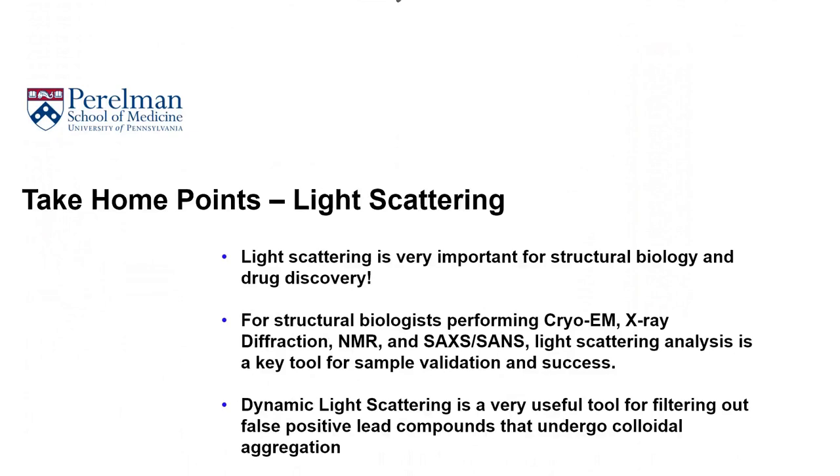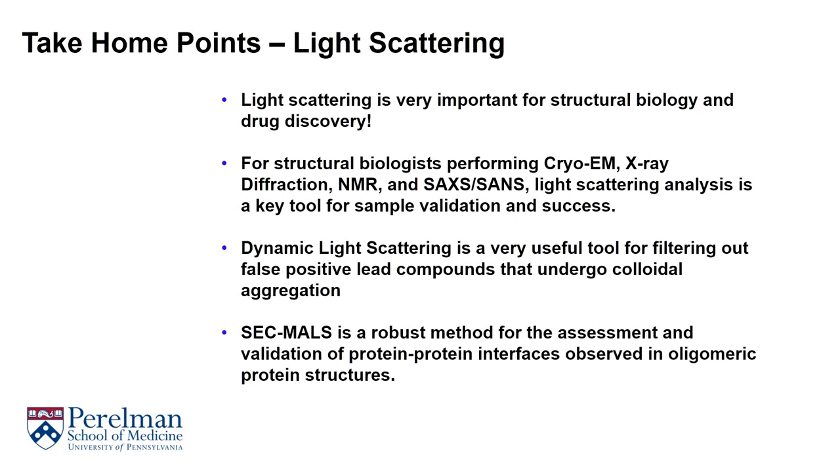To wrap things up, some take-home points on light scattering. First, light scattering is very important for structural biology and drug discovery. For structural biologists performing cryo-EM, X-ray diffraction, NMR, and SAXS/SANS, light scattering analysis is a key tool for sample validation and success. Dynamic light scattering is a very useful tool for filtering out false positive lead compounds that undergo colloidal aggregation. And lastly, SEC-MALS is a very robust method for the assessment and validation of protein-protein interfaces observed in oligomeric protein structures.